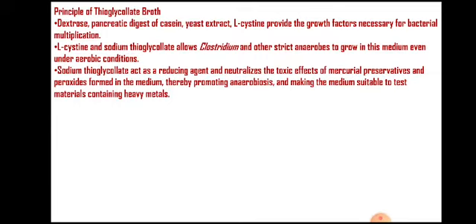Now, sodium thioglycolate is a principal component which is present in the medium, and it is responsible for the consumption of oxygen. It is a reducing agent, and it consumes oxygen, thereby allowing the generation of anaerobic conditions. It is a semi-solid medium.